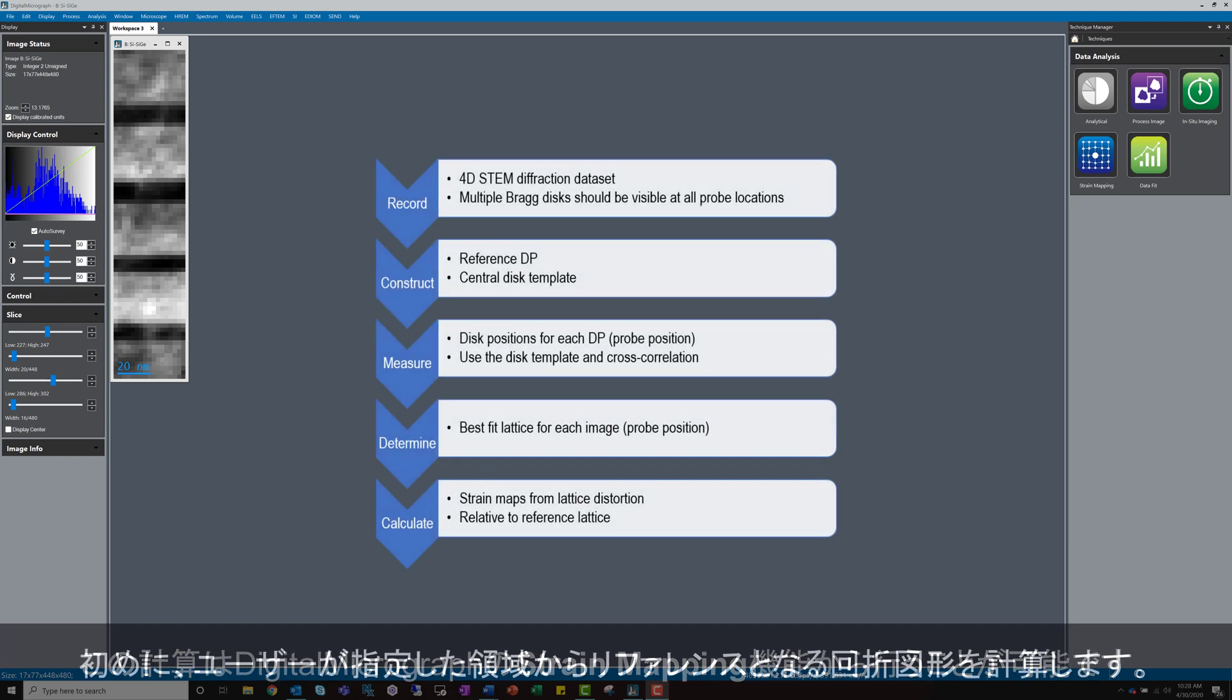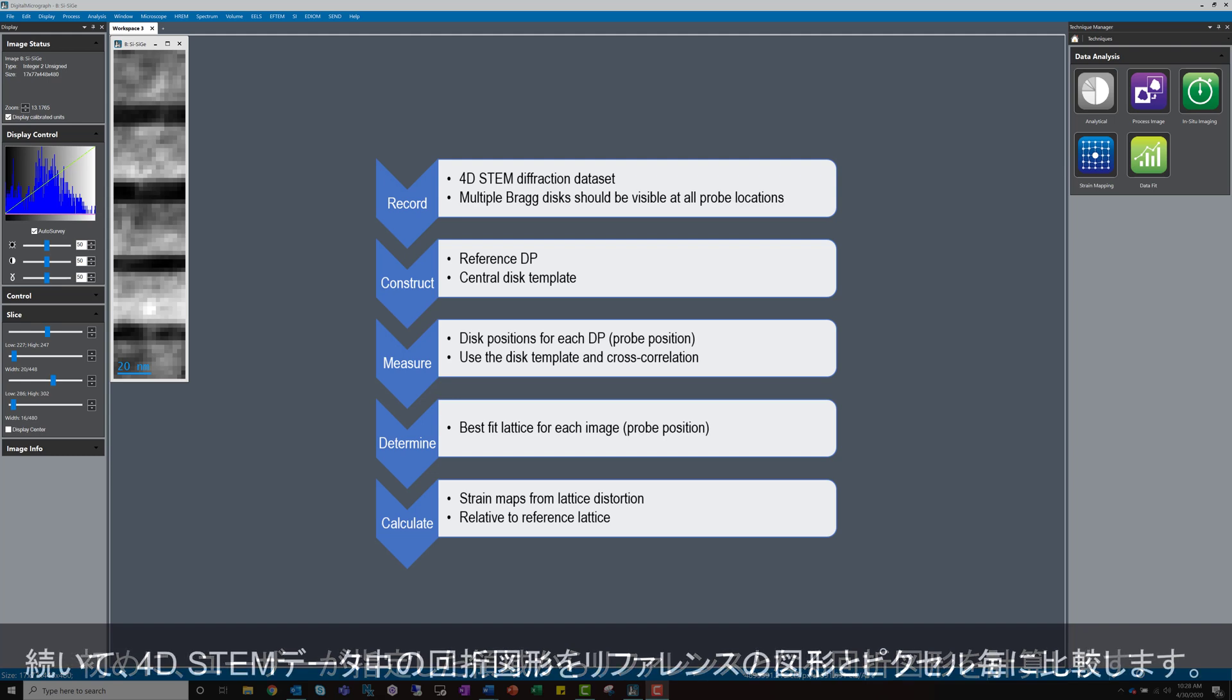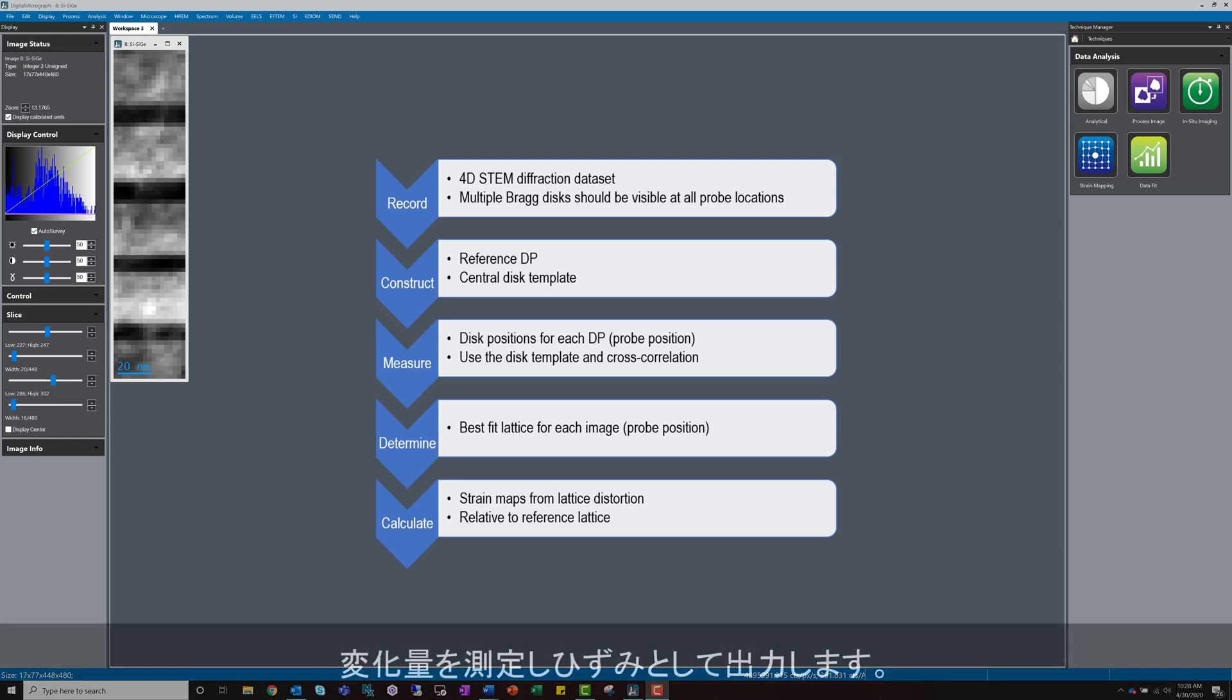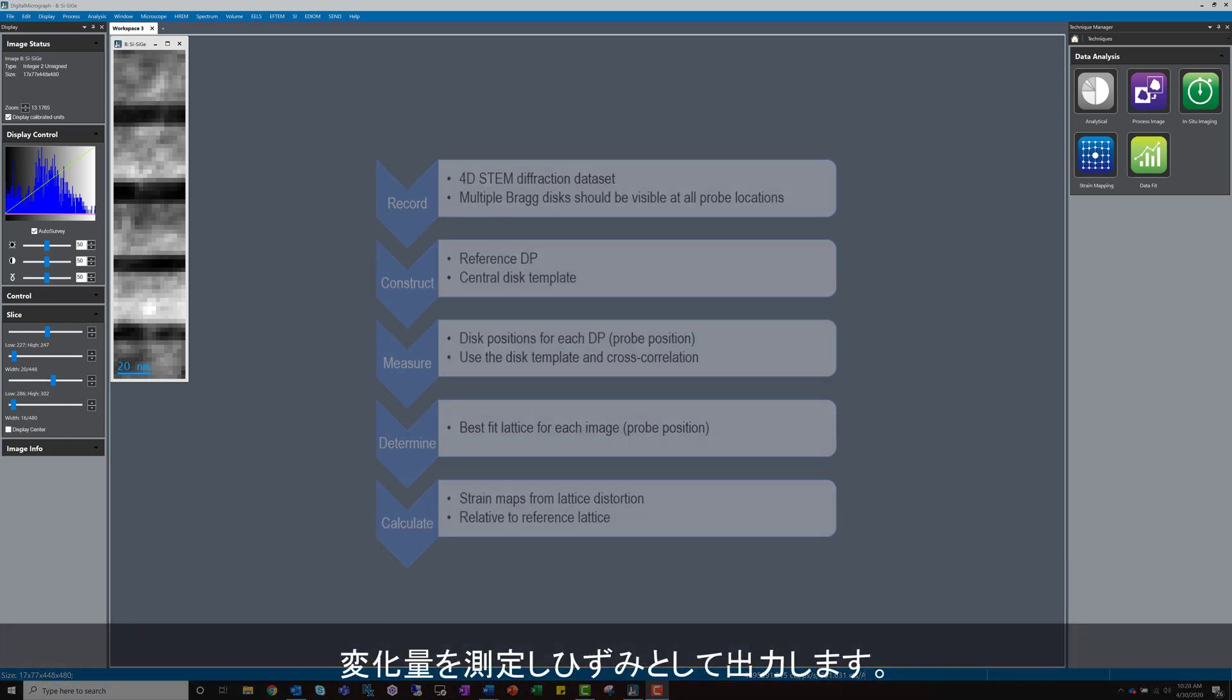It first calculates a reference diffraction pattern from a user-defined reference area in the sample, then compares the diffraction patterns in the 4D STEM data, pixel by pixel, to this reference image, measures the change and outputs the strain.